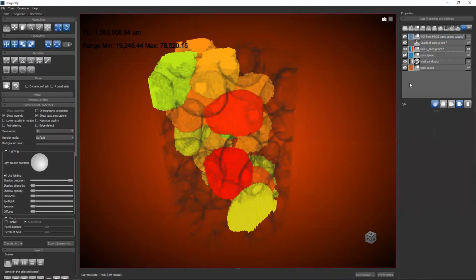Okay, two things. I know that there's a lot more questions you're going to have, and we will cover those in future webinar topics. This was just to give you a crash course. This whole set of lessons 1 through 5 are to give you a taste of what you can do with images, meshes, graphs, multi-ROIs. Tomorrow with our lesson 5 with the Movie Maker. So this is not meant to be exhaustive. There are a lot more things you can do.